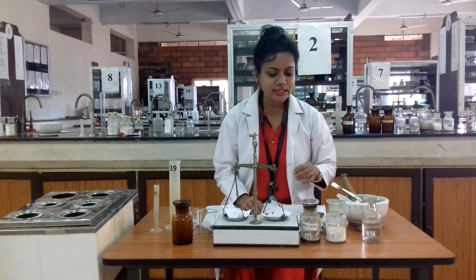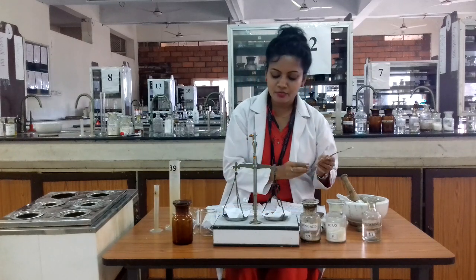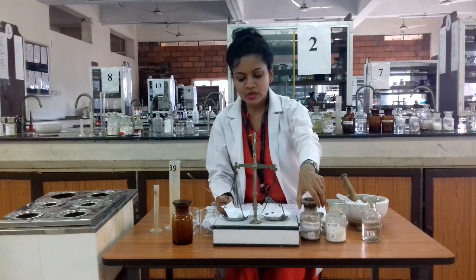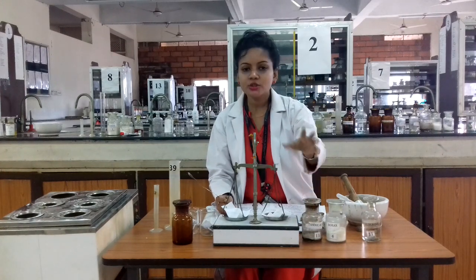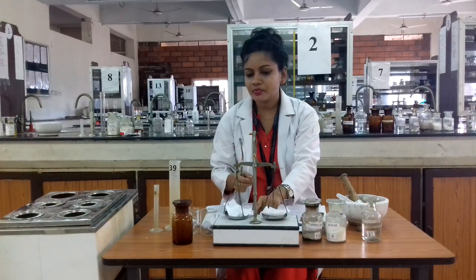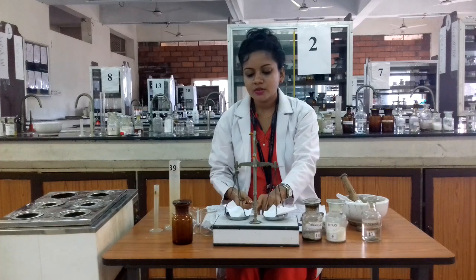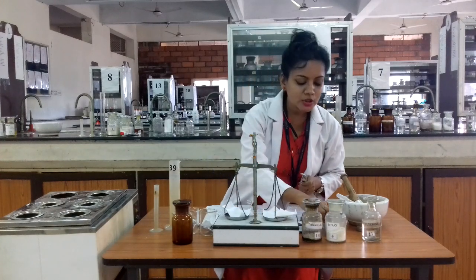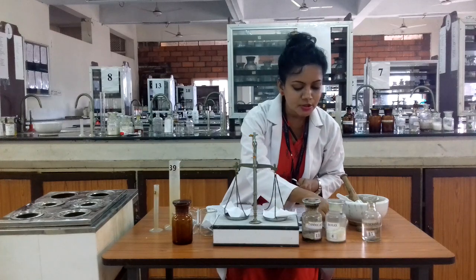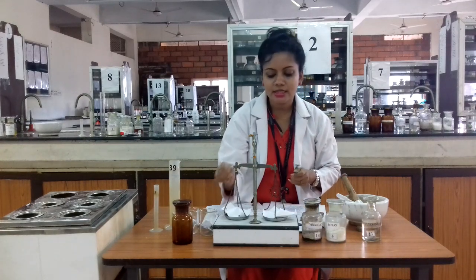For the 20 ml preparation, we start weighing the first ingredient, which is tannic acid. For 20 ml, we need 2 grams of tannic acid. First we check our balance, then we start weighing 2 grams of tannic acid and put it aside.